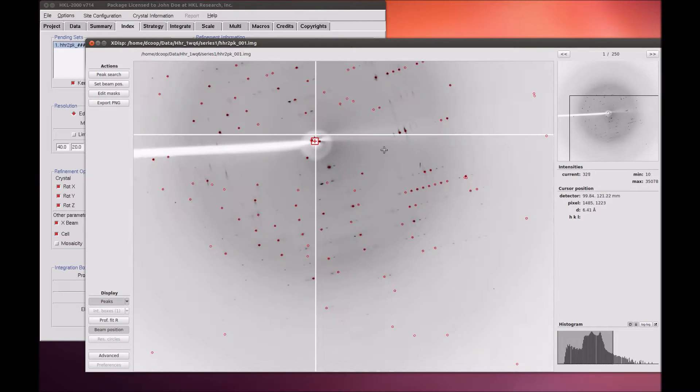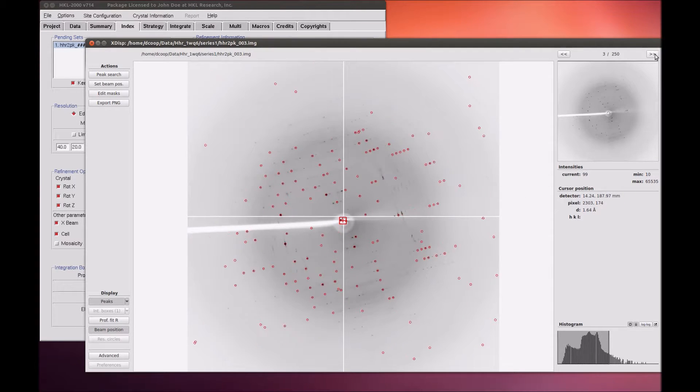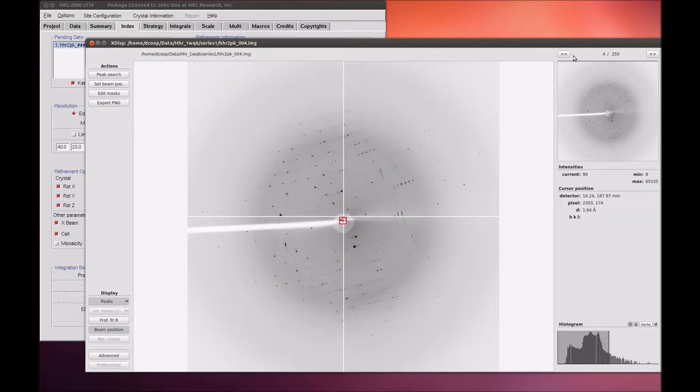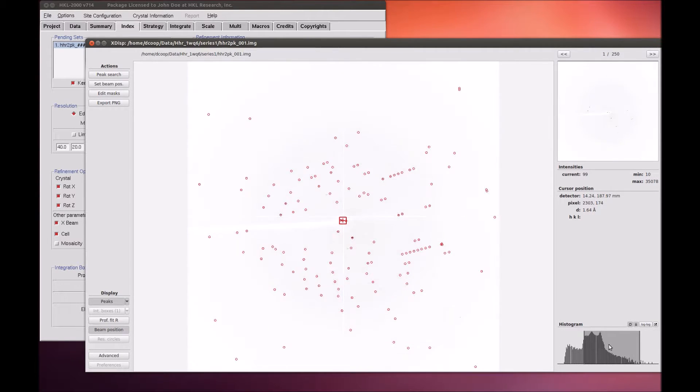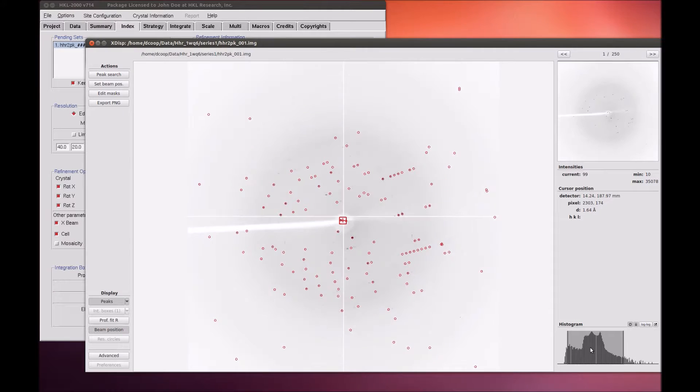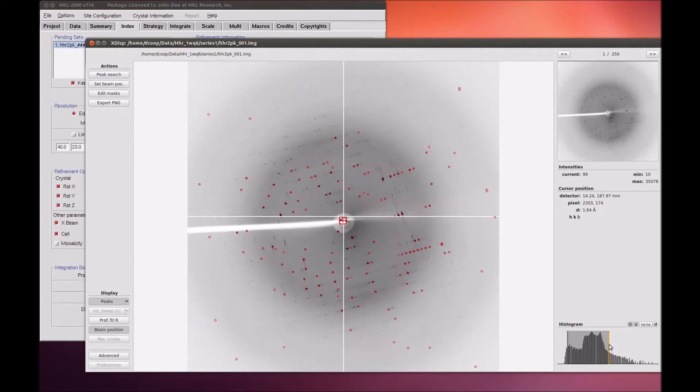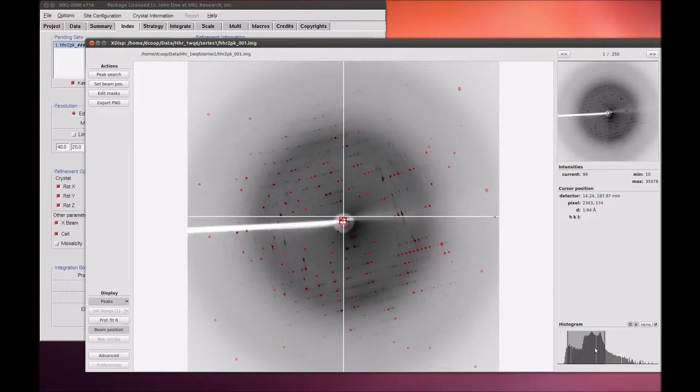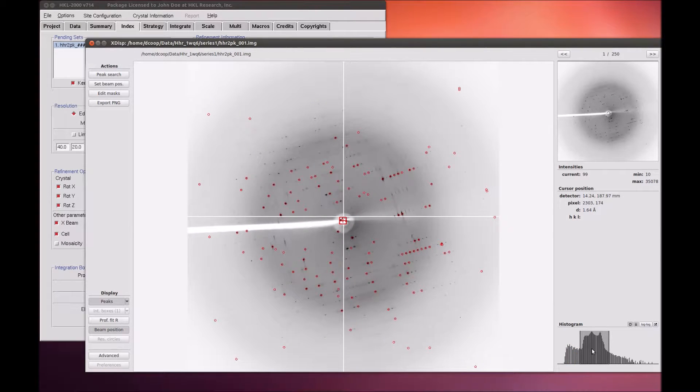The frame up and down arrows are on the top right. Change the intensity maximum and minimum using the intensity histogram on the bottom right. Click and drag the shaded box to change the range of intensities, or drag an edge when it turns yellow to change just the maximum or minimum intensity.